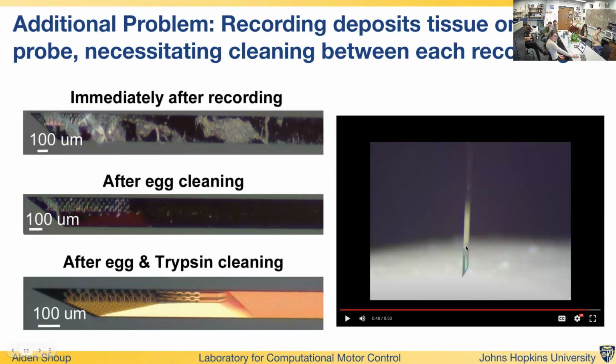You can see here that the contacts don't have any gunk on them. And that process has proven to work quite well for us without damaging the probe, and also restoring the functionality of the probe to an extent.